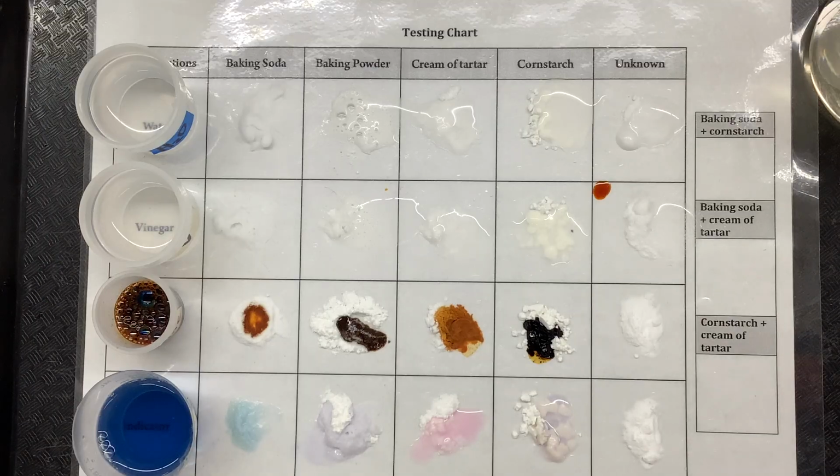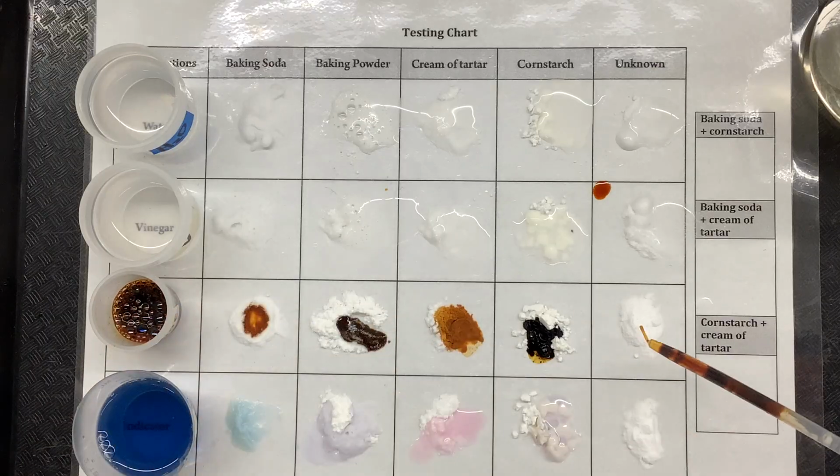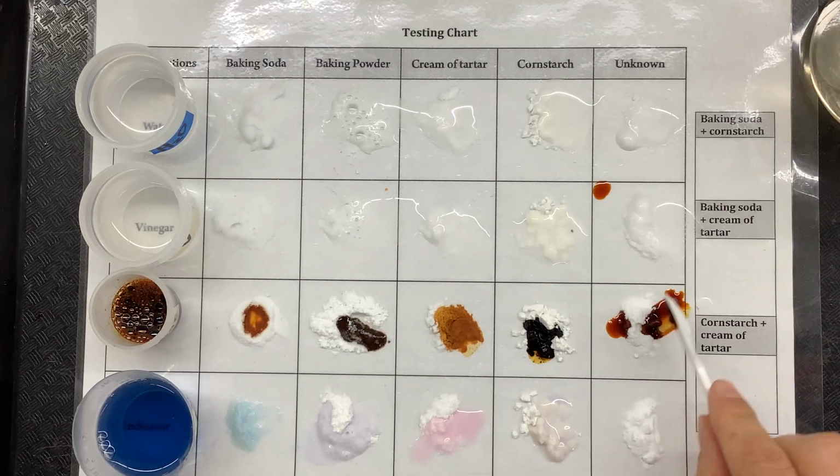And then now we're going to do iodine and our indicator. Rinse out our dropper. Okay, iodine. Okay, wow, that's really black. Okay. That's interesting. It's very red, but it might change color.